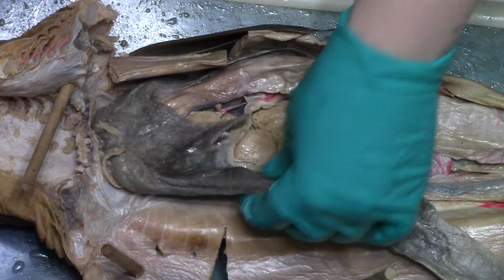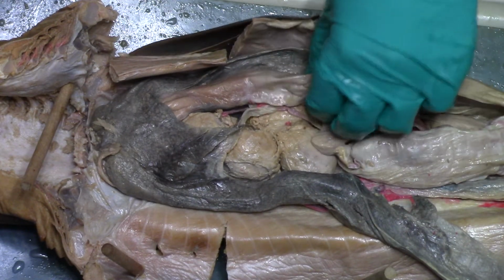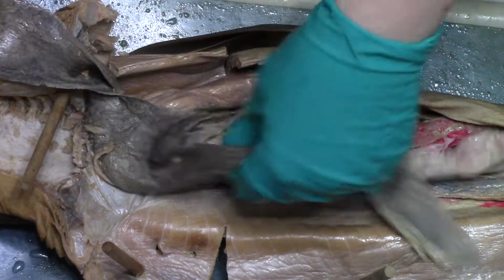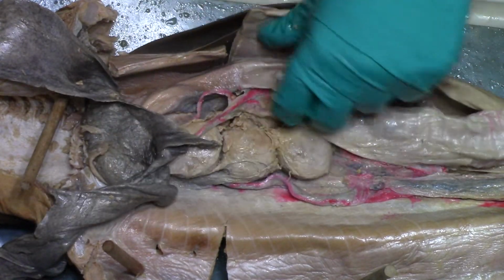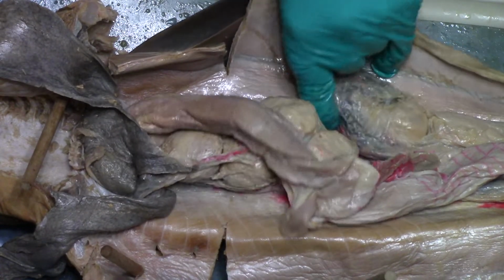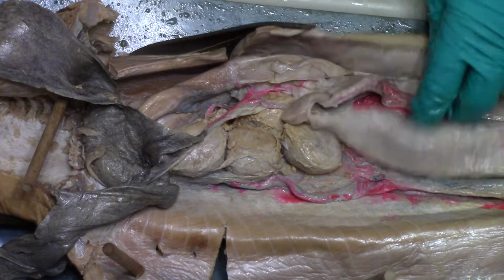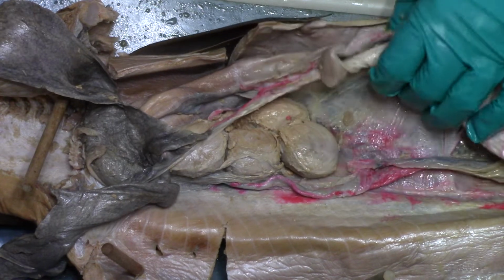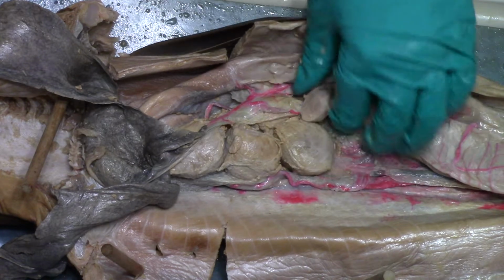So I might remove those so we can open them up and look at them, and then look at the things that are underneath. Once we move the liver out of the way, there's the arteries leading to the liver. Everything artery is hepatic, everything kidney is renal. This is probably eggs.